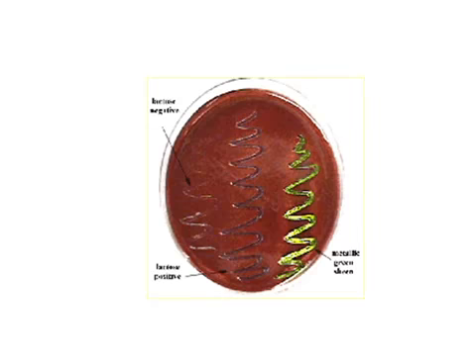This is another picture of an EMB agar that has been streaked or inoculated with three different bacteria. In the first streak here, it's hard to see in the picture itself, but this is a line of bacteria growing in a whitish color. Since it's growing, it is a gram-negative. It has no color. It is white. So it's a gram-negative that cannot ferment lactose. In our second streak, we can see the bacteria is growing, but it's growing a dark purple-black color. Therefore, this streak represents a gram-negative bacteria that does have the ability to ferment lactose.